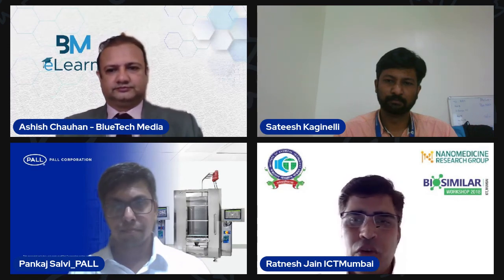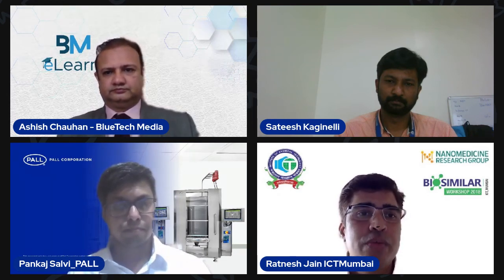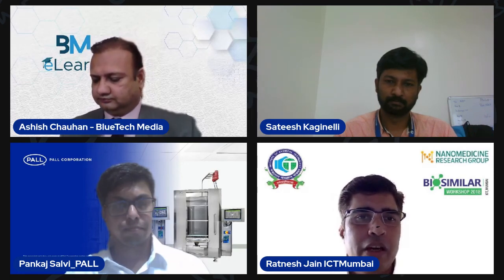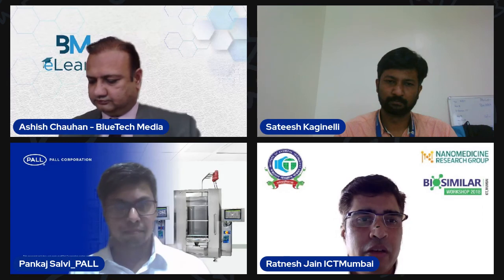Yeah, so thank you for this question. First of all, with respect to large-scale culture, whenever one is conducting it, it is not advised to change media. When you reach the media stage and large-scale culture is going on, it assumes that the media conditions have been optimized. So it is not advised to change that stage. As far as filtration systems are concerned, I'll probably pass this question to Pankaj. Probably he could answer that in a much better way. Pankaj or Satish, both of them can probably answer whether a microfilter attachment may be a nice idea or not. Yeah, any of you who can pick?